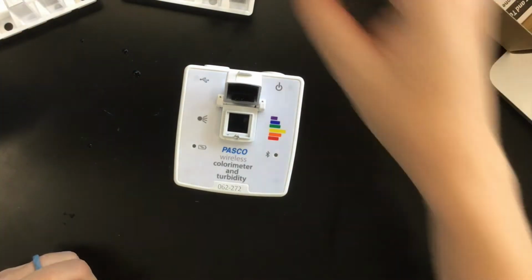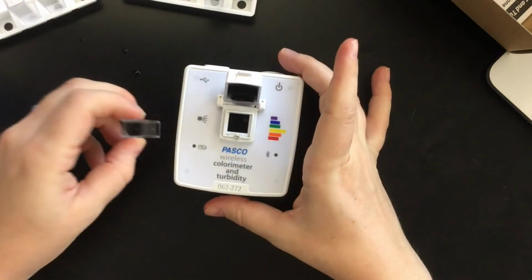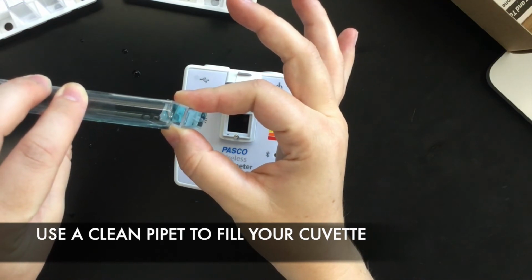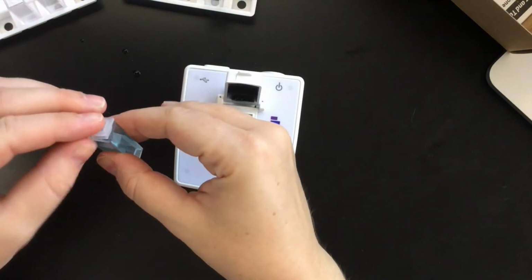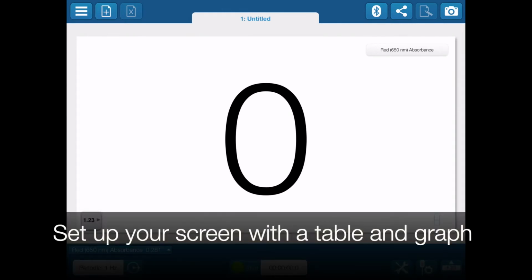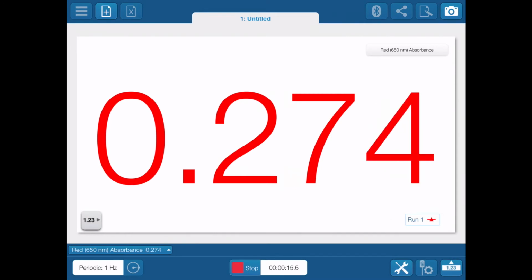Put it down. And then you're going to want to fill a clean, dry cuvette with your solution. So you open it up. Here I have some solution that's blue, and I'll pour it in, being careful not to overfill it. That's plenty. Then I will close my lid, put it in, take the absorbance. Once you have your sample in there, you'll just press Start, and an absorbance will come onto your screen. The numbers may move around a little bit. They should steady out at one number. Click Stop, and this is the number you will record.